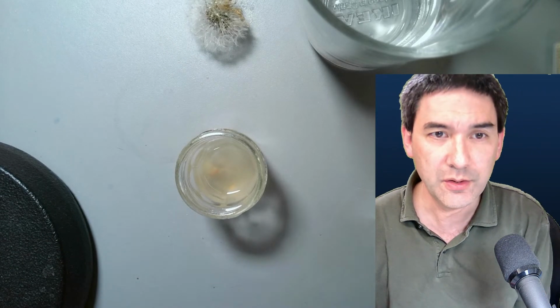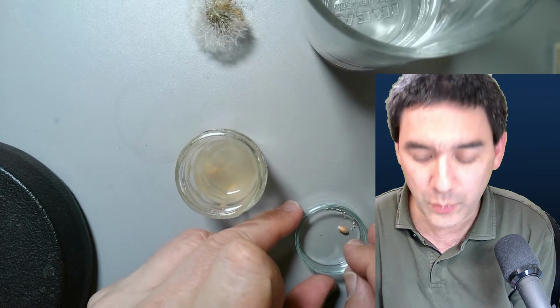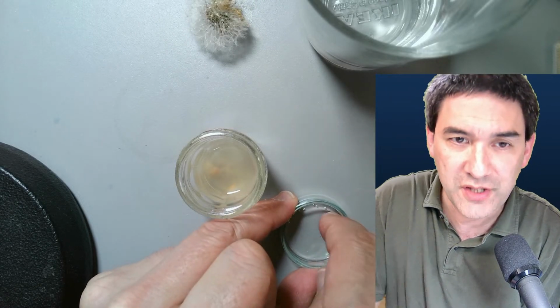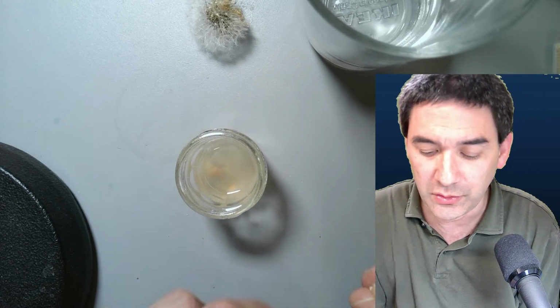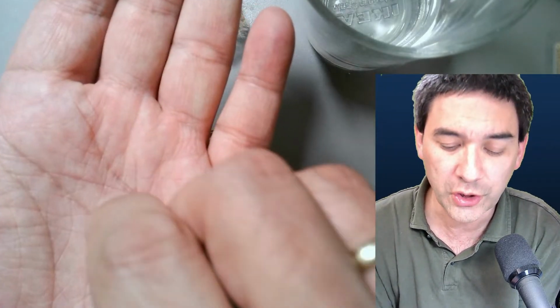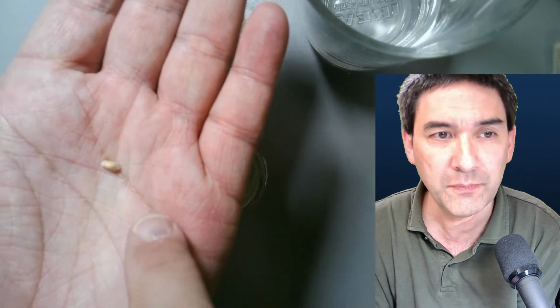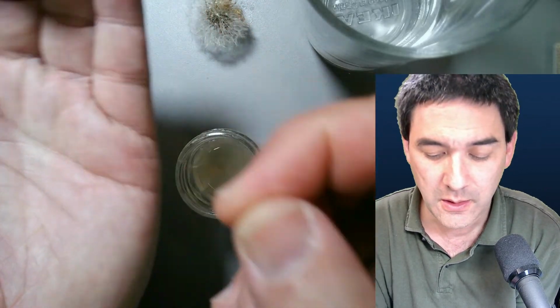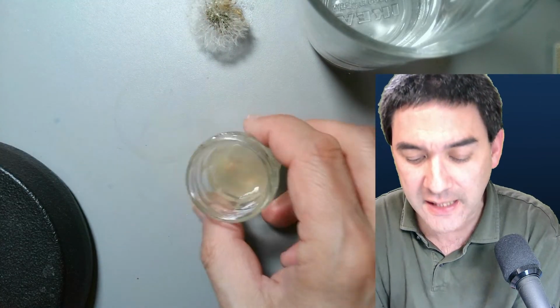This is a wheat grain, whole grain. The small dots that you see here are yeast. You take a wheat grain, which contains a lot of starch, crush it between two spoons, and add it to the pond water, and then you wait a week. And it's going to turn pretty nasty.